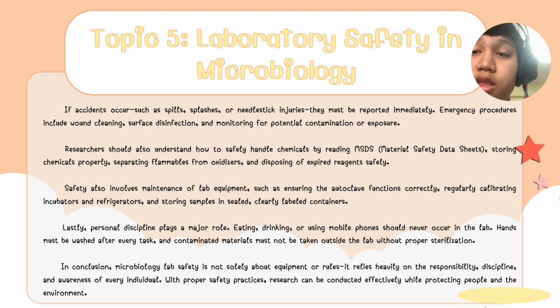Lastly, personal discipline plays a major role. Eating, drinking, or using a mobile phone should never occur in the lab. Hands must be washed after every task, and contaminated material must not be taken outside the lab without proper sterilization. In conclusion, microbiology lab safety is not solely about equipment or rules.